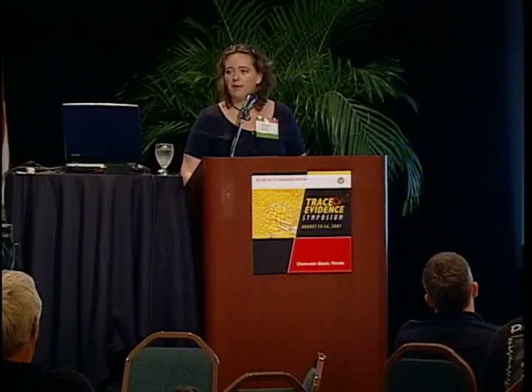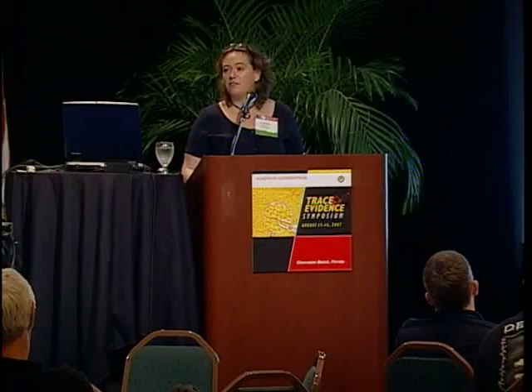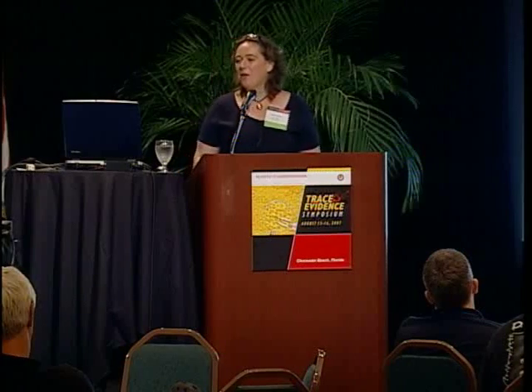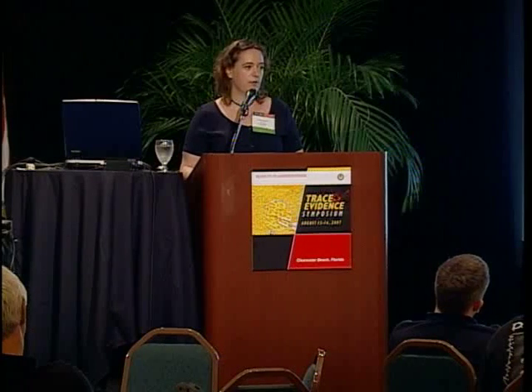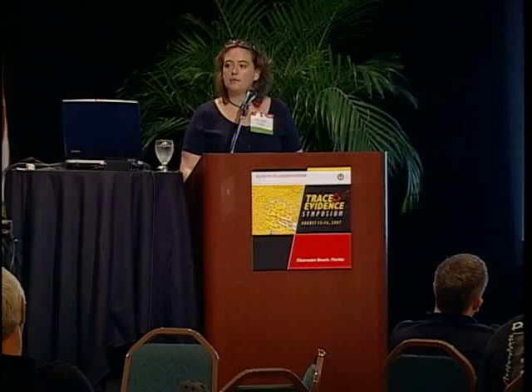Just to show you, for those of you who aren't paint examiners, what we actually do with the paint once we've got it. So this particular picture is of a green paint. Dark field microscopy. As I said, I was under the tutelage of Pam Hamer, so microscopy is fast becoming one of my loves. And paint under the microscope is incredibly beautiful. What this particular picture is showing is this is green paint, but by the time you've got up to this kind of magnification, you can start to see that it's made up of yellow and blue pigments. There's very few actual true green pigments. So we can start to make an assessment, really, of what the paint is and how it's put together.